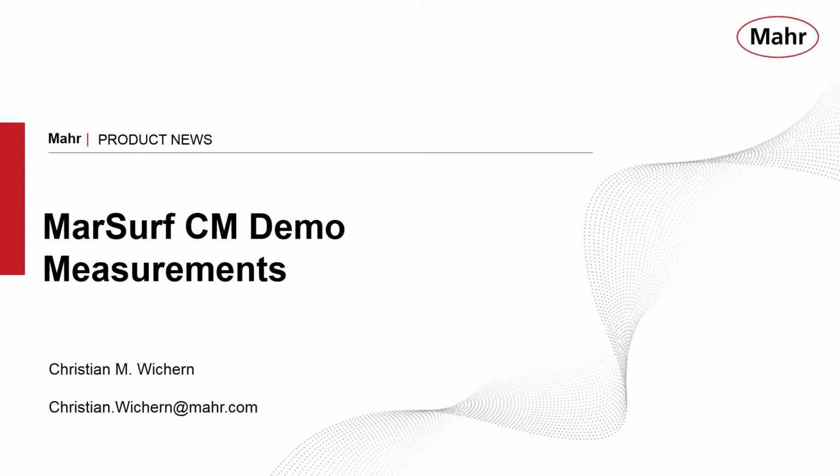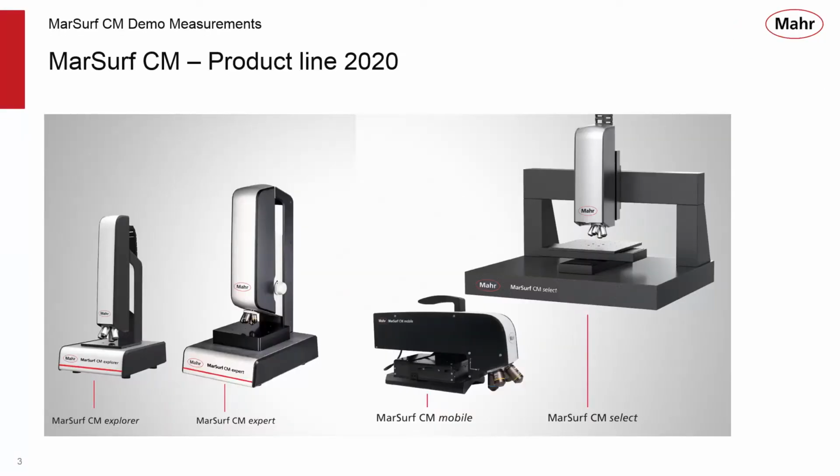So let's take a quick review of what we have on the agenda for today's demo measurements. We'll start out with just a review of the MarSurf CM products. The MarSurf CM family of products are confocal microscope-based surface metrology tools. These tools can be used for measurement of surface finish, microgeometry, microcontour, as well as other more advanced topography type of quantifiers. In my last webinar, we spoke about an update to the product line for 2020.